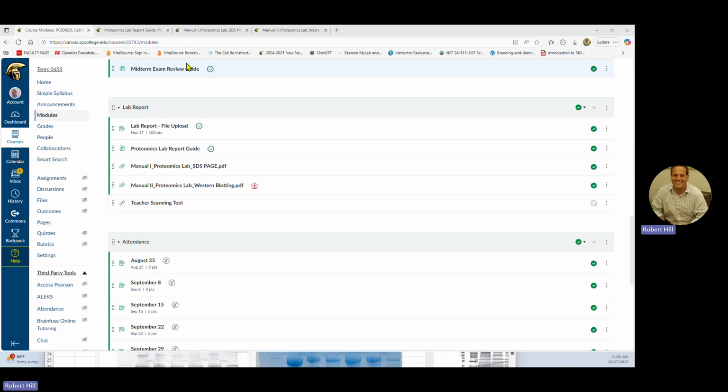So this is a recording which will be like an instructional on how to generate your lab report. Okay. So I'm going to have a lot of windows open. I'll be doing a lot of clicking back and forth as I go between different files.